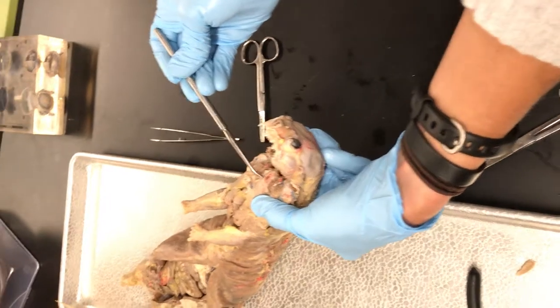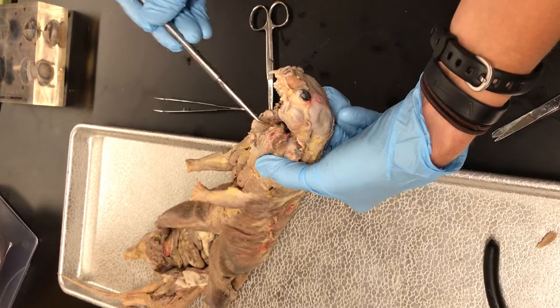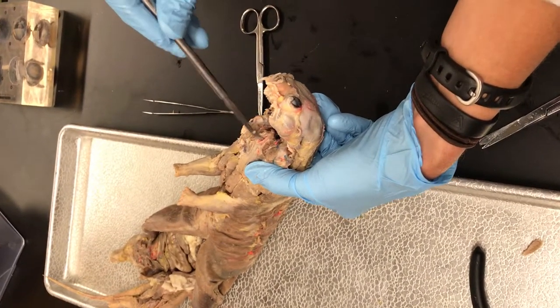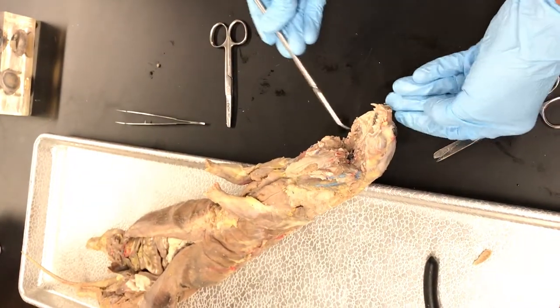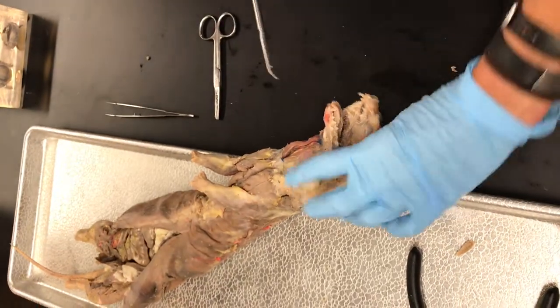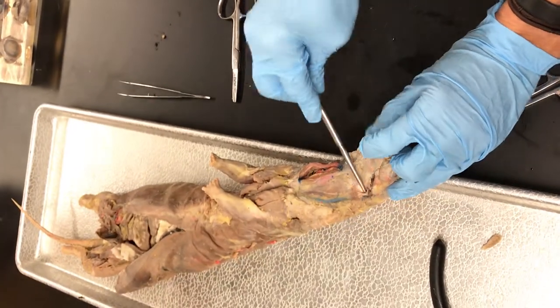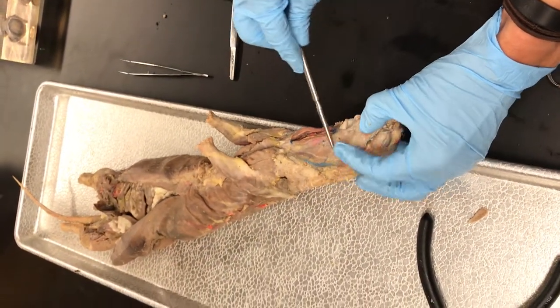This little white thing here is the epiglottis - that's what's going to cover his trachea. And then the opening is called the glottis, and that's the opening to the trachea. The main things to find in here are: the internal nares, soft palate, hard palate, tongue, and external nares - or his nostrils. We found one mandibular salivary gland, and the other one is right about there.